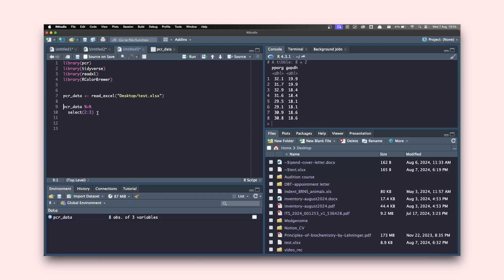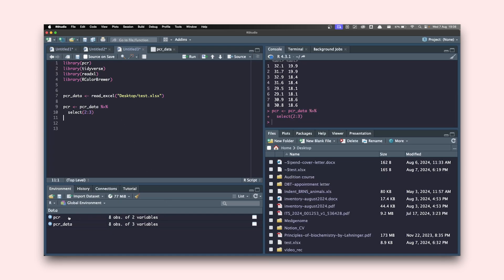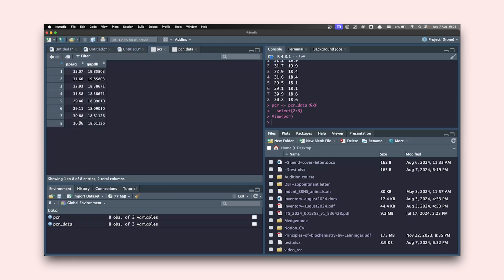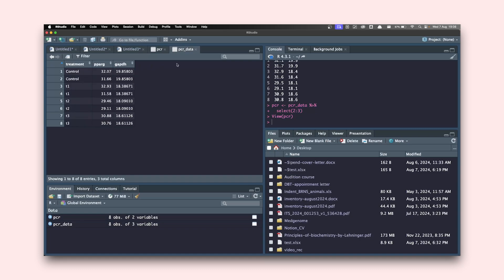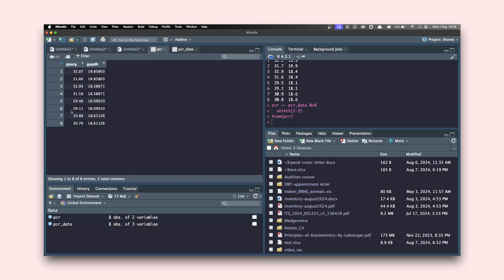This result is not yet stored inside any variable — it's not an object in the environment. We are going to store it in a variable called pcr. Once we write that and hit Command+Enter, a new object is created. Clicking on it shows only the second and third columns — the first column has been removed compared to the original imported table.